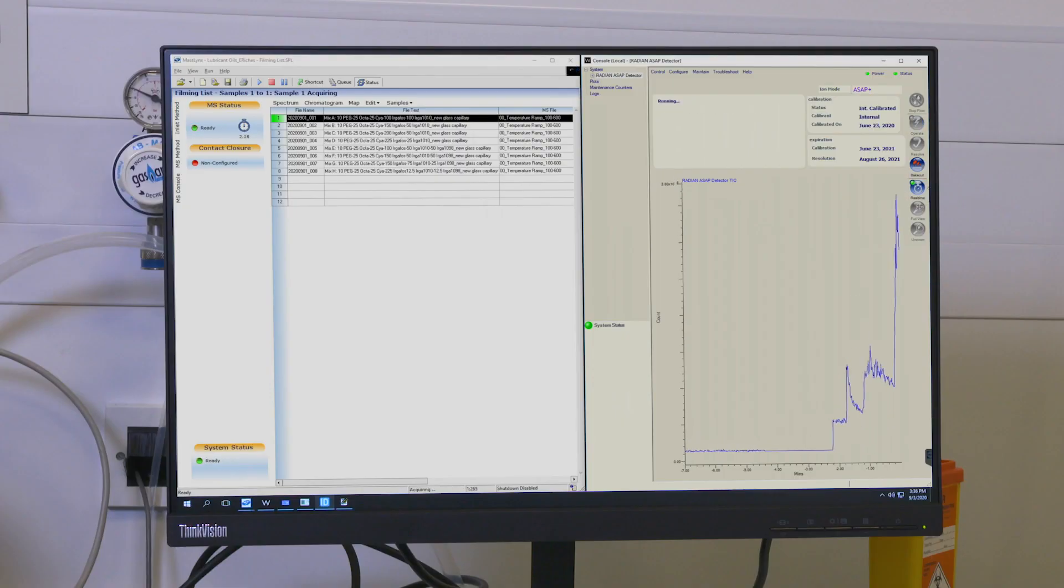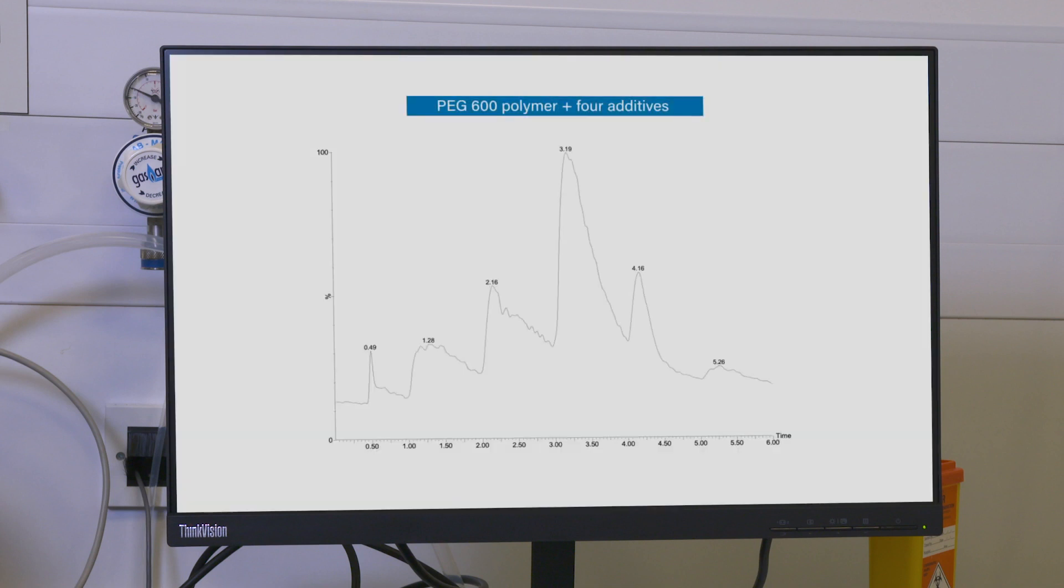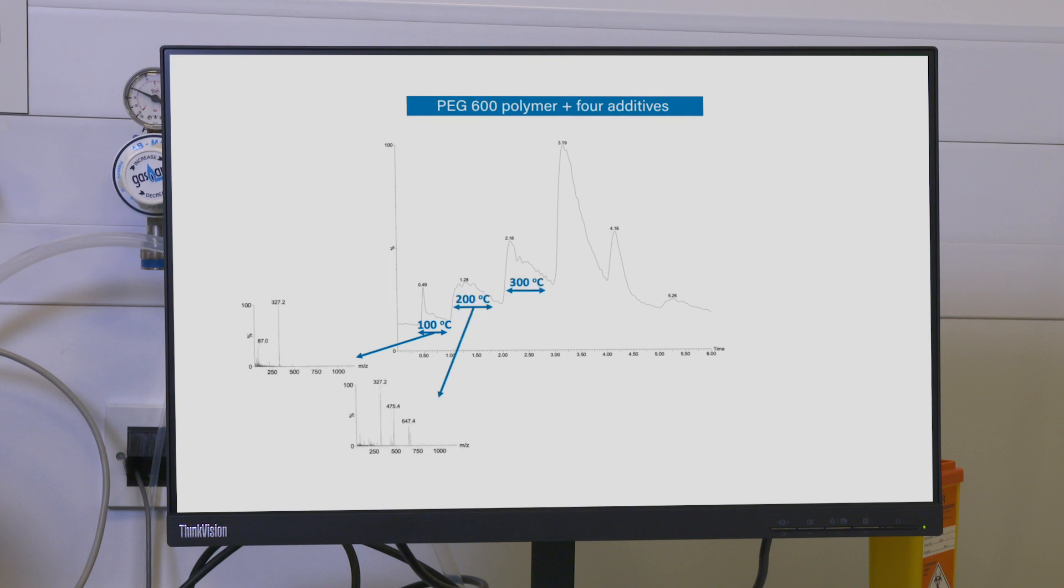Here is the resulting thermal profile from the pre-programmed temperature ramp. We can see the different spectra evolve at different temperatures. Key components appear as each boiling point is reached in the thermal gradient.